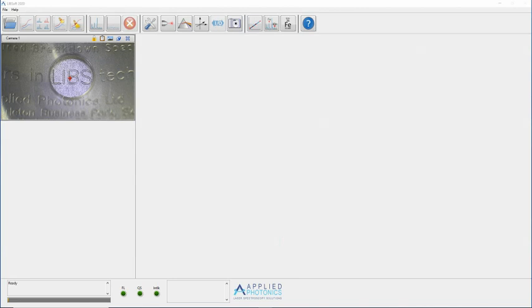Each camera in the imaging kit is connected to a video grabber device, which is in turn connected to the system computer. LibSoft will automatically detect the number of cameras connected during the initialization process. Note that the software actually detects the video grabber rather than the camera itself, and so it is important to check that the video grabber is connected to the computer and that the camera is connected to the video grabber and powered correctly. The main screen of the application will then be configured to display live video from each of the cameras detected.